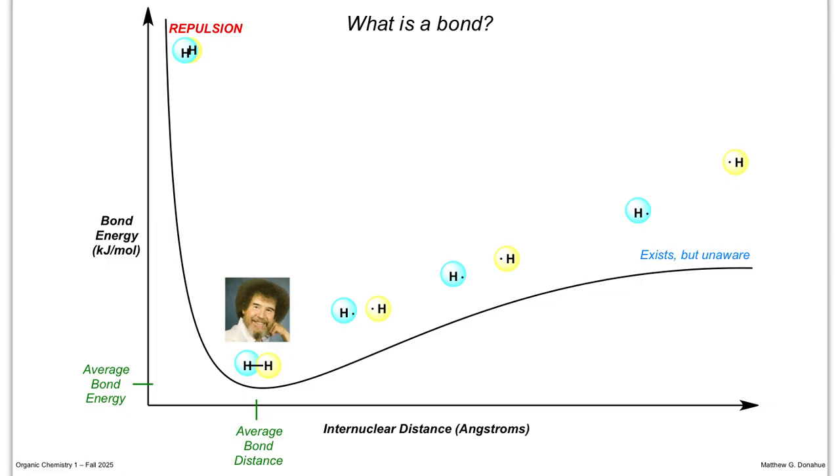It's moving like that, like a spring. So when there's a dipole between them, based on electronegativity or whatever, it's still moving. So when the IR light hits that, it's stretching it back and forth. And then the detector of the instrument sees that as a response. And based on what this is and this is, there are different functional groups. That's why you see them in different regions.